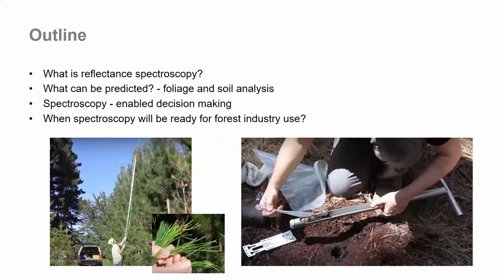The outline of the talk today will start with what is reflectance spectroscopy, what can be predicted for foliage and soil chemical analyses, how spectroscopy has enabled decision-making, and when spectroscopy will be ready for forest industry use.